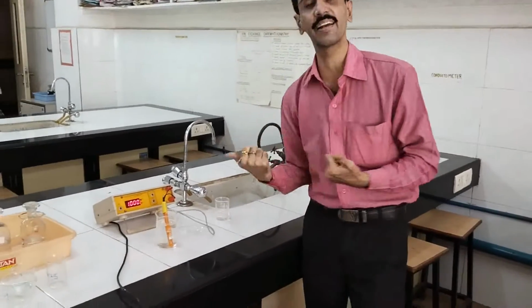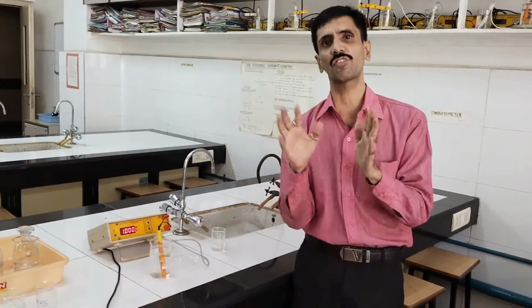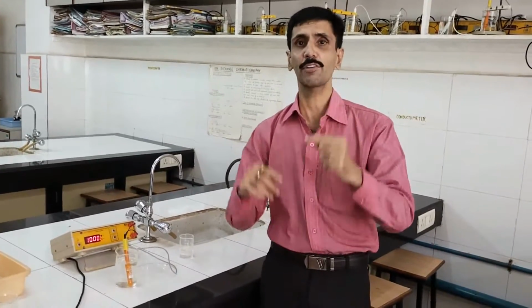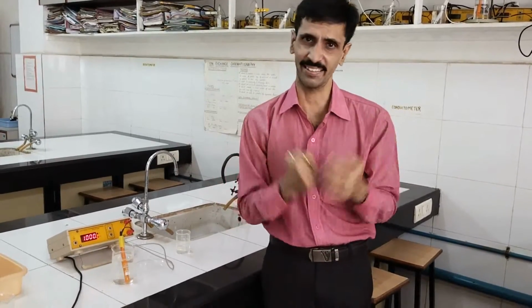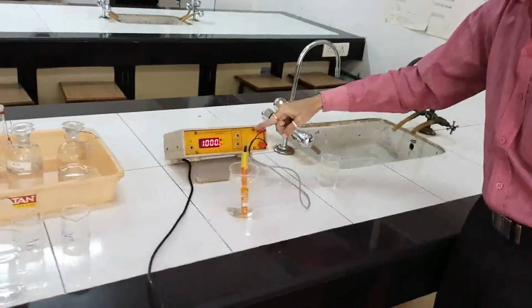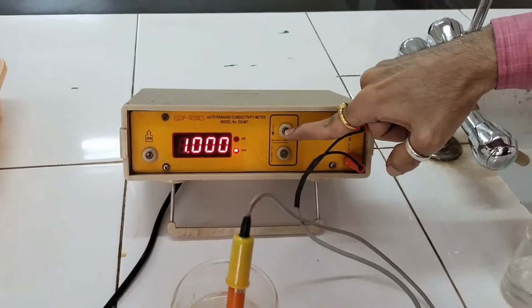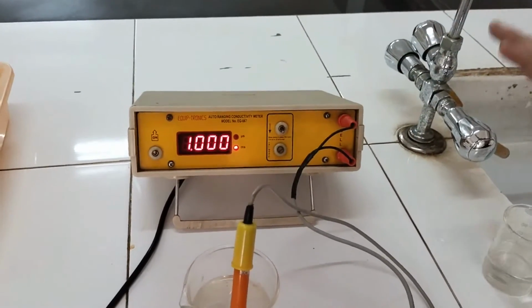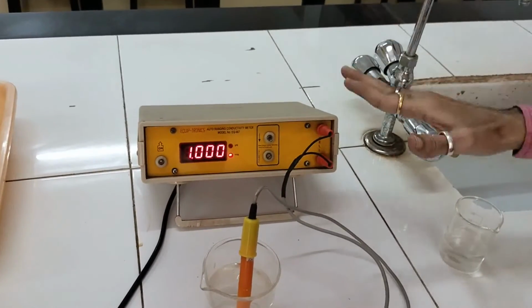Now the instrument, as I said, is a conductometer. The second point is, once the instrument gets stabilized, you need to go for its standardization. Make sure that before you actually start with the readings, the instrument under consideration is standardized. So here we have a conductometer. There is a standardization knob which you can see over here, and there is an arrow over here. It has to be in the downward mode, and see this, it shows 1.000. So this is a very clear indication that this instrument is standardized, and now you can take the readings on this particular instrument.